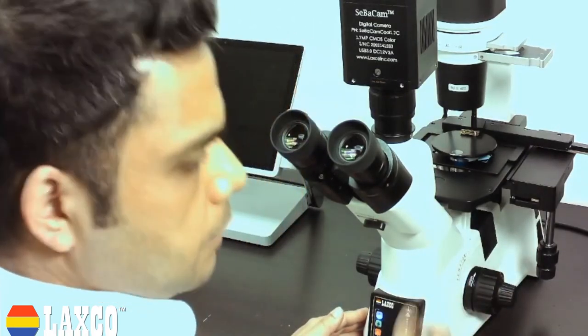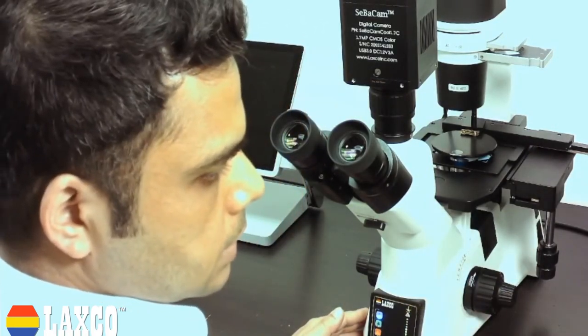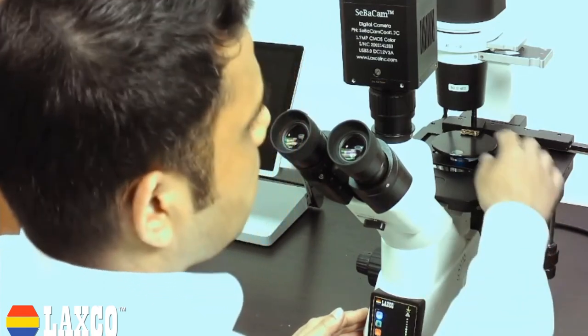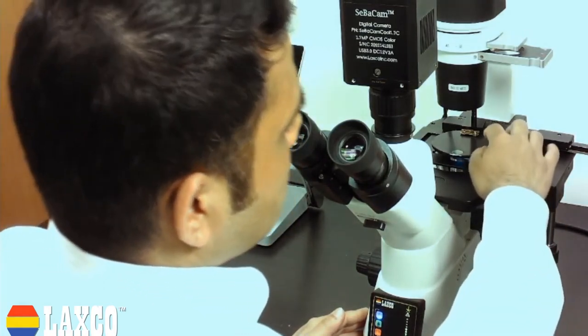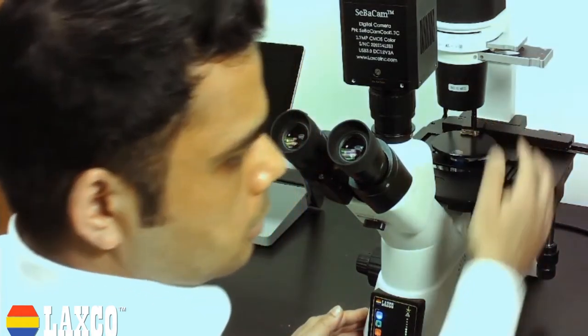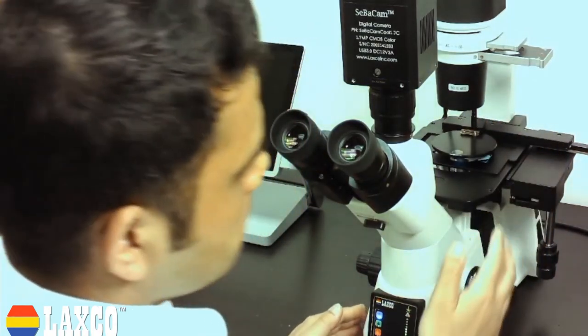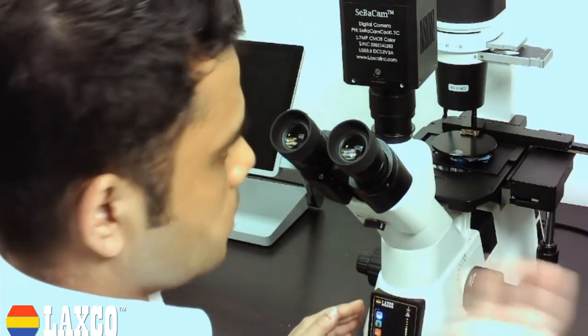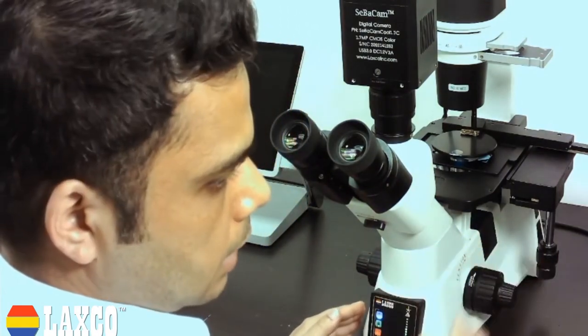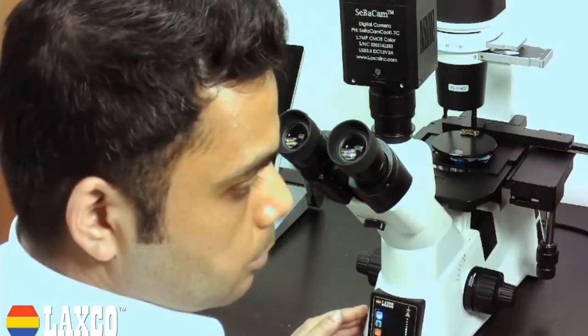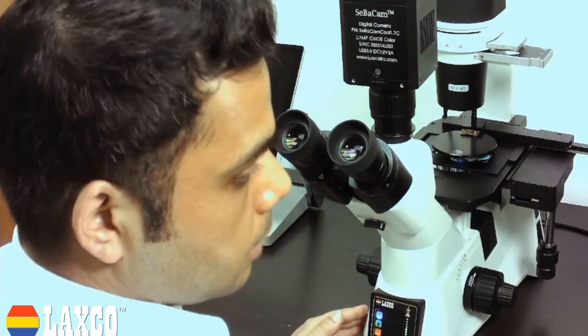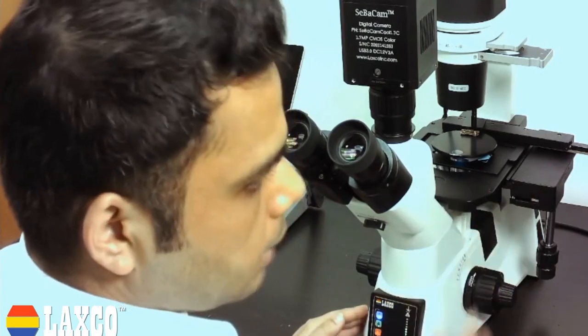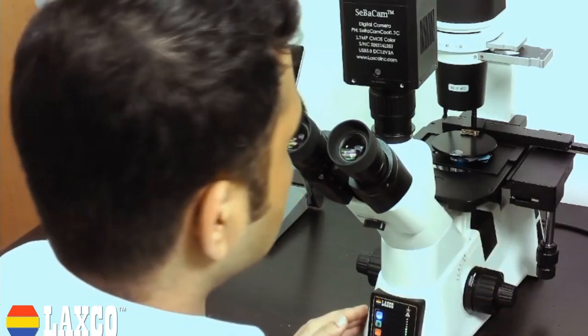A cool feature of this system is that we have added a dark room shield here. So this acts as a barrier to any external fluorescent light that might fall on your sample and interfere with your signals. So that does a great job of blocking that.